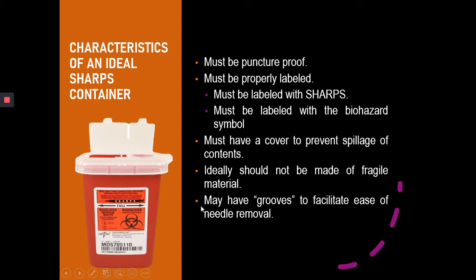Because after you collect the sample from your patient, since recapping is prohibited, you just have to place your used needle on that groove and then twist the barrel. Automatically, the needle will fall inside the sharps container.